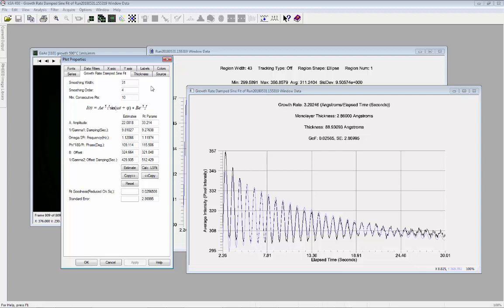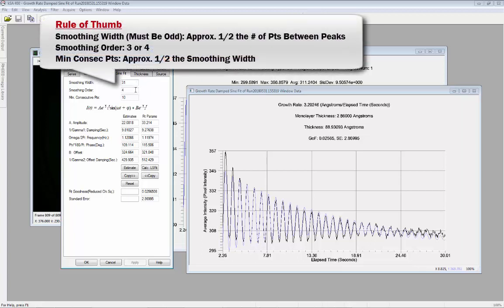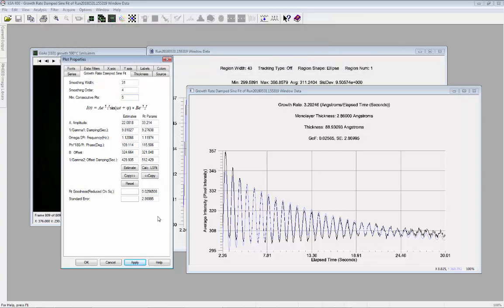In some cases, the smoothing parameters may need to be adjusted to get accurate values for the extrema. The user can specify the width of the smoothing window and the order of the smoothing polynomial. To filter out erroneous zeros caused by noise, it is required that there be a minimum number of consecutive points with the same slope preceding a given extremum in order for it to be considered valid. This parameter can also be adjusted. One can see the effect of changing these values on the parameter estimates by selecting Estimate.